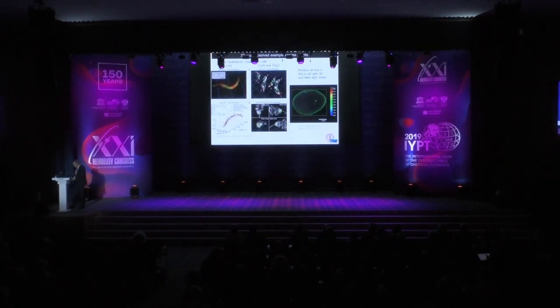So using these 3-dimensional techniques, you can now look at structures inside bacteria on the left and see the full 3-dimensional shape of a helix-like structure. You can see structures at the ends of cells that certain proteins make. And on the far right, I'm hoping this one works. Does it work? The nuclear lamina? Yes, that one works. This is the nuclear lamina in a mammalian cell. So in almost all of our cells, there's of course a nucleus and a nuclear membrane.